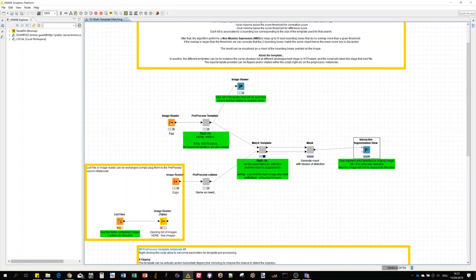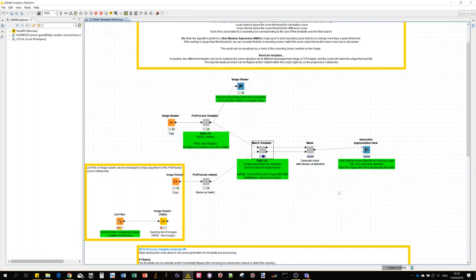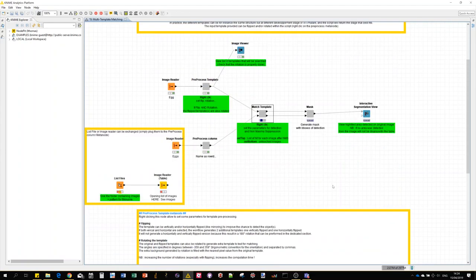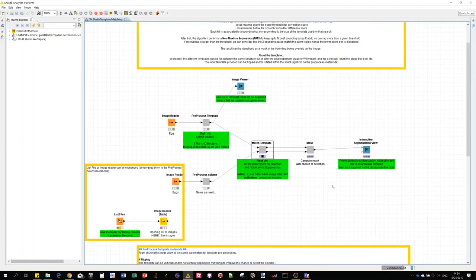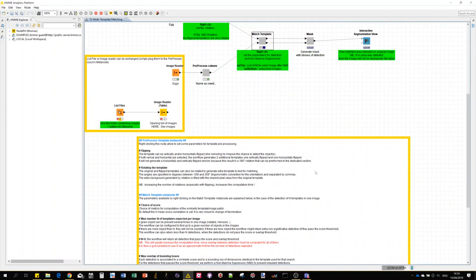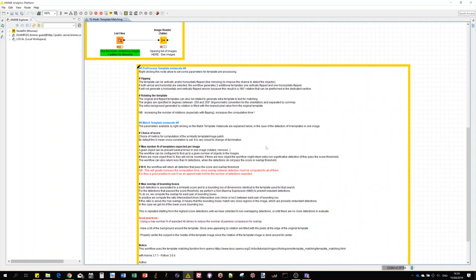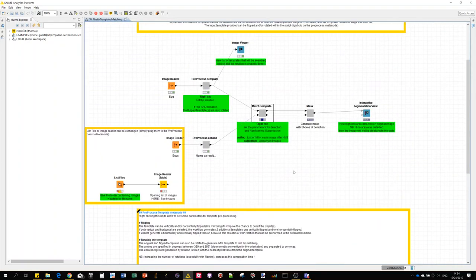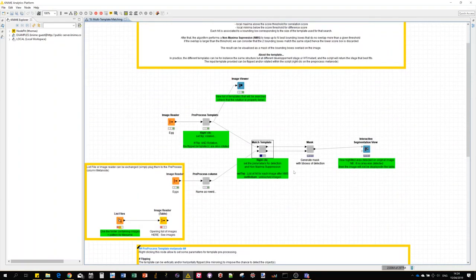So again, you can reuse basically parts of the workflow in a custom image processing workflow where then you would do some analysis on the detected area. Pointing to some classification, object analysis, this is completely possible. You also have some documentation provided in the template itself here about the parameters, and as well on the wiki. We have a wiki section on the GitHub repository.